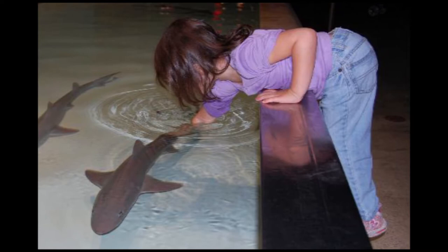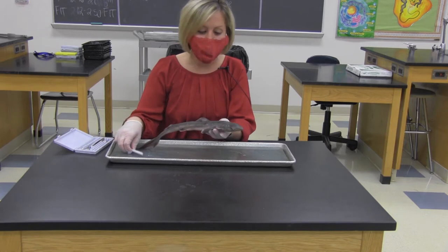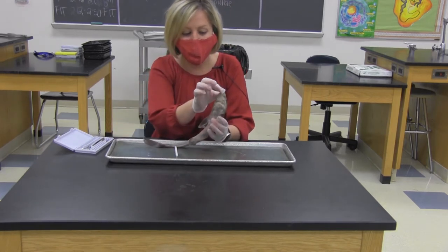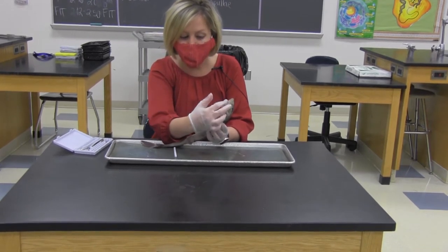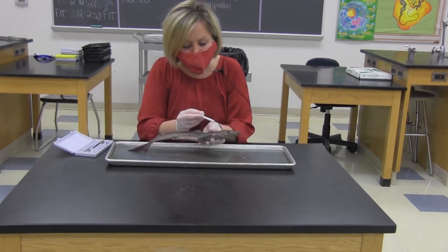First, we're going to take a look at the outside, or exterior anatomy, to get acquainted. This is going to be the front end. You can actually see the mouth is not terminal — it's actually on the underside. Here's the mouth. They also have two nostrils — you may not be able to see those — and you can see the eyes here.